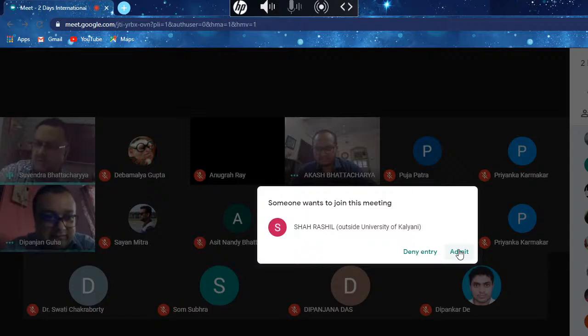No, usually we always get some kind of software with the microscope with some modules attached. But in this case, we use a very advanced one, which is called the Imaris platform, and they have different kinds of modules that can be added on the main software, for example, a co-localization module and an organelle tracking module, something like that. So these modules are used separately, and this is a little bit costly software to get.